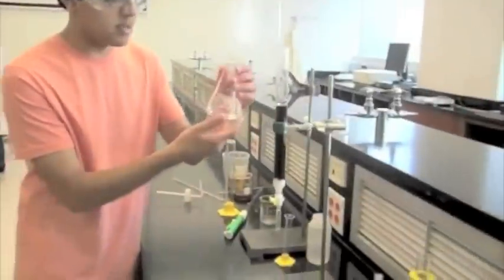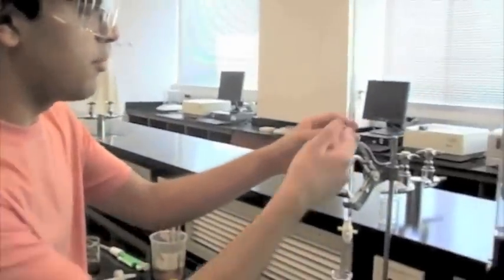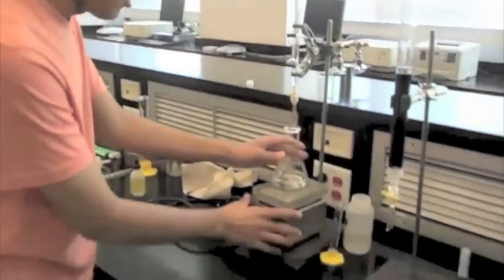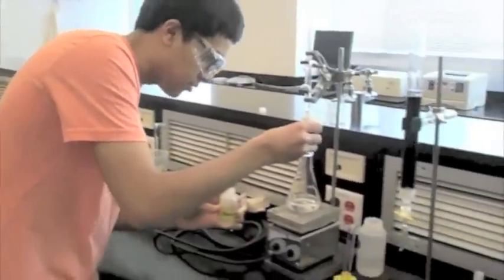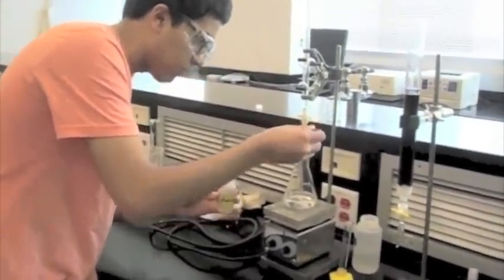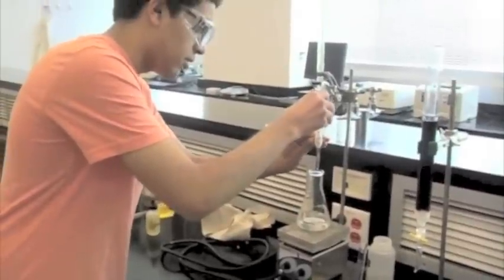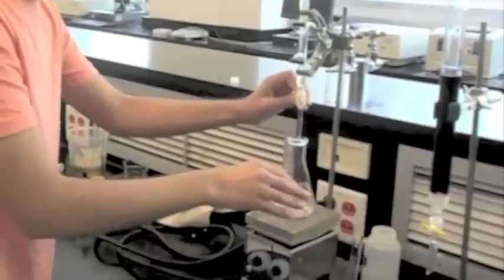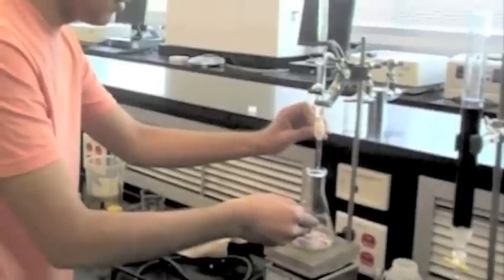Now the third step: titration. Have a clean 50 milliliter burette set up with a ring stand and a burette clamp, and fill the burette with NaOH stock solution. Add 2 to 4 drops of phenolphthalein indicator into your collection. Set the flask onto a stir plate, add a magnetic stir bar, turn the plate on, and begin releasing the NaOH slowly into the flask. You'll soon start noticing pink blotches appearing and fading. The more NaOH you pour in, the longer you'll see the pink color. You eventually want to end up with a light pink color in the flask.